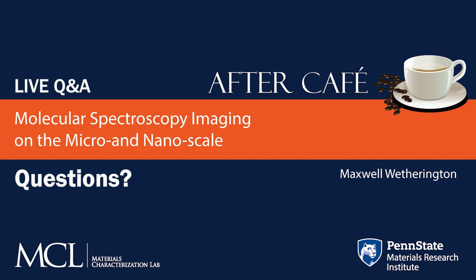This is all about looking at the highest resolution we can achieve. So if there is an interface, or you're looking for a contaminant that's really small, or you're trying to map out heterogeneity on the nanometer length scale, those are things that I think Nano-IR is suited to help answer. But before you jump to that, there are things we can do with our standard spectroscopy techniques that can certainly help identify the composition, contaminants, or strain, orientation. As I mentioned, all of these things can show up in the molecular spectral response.